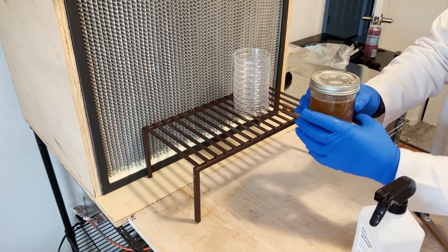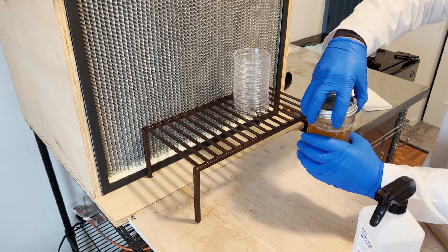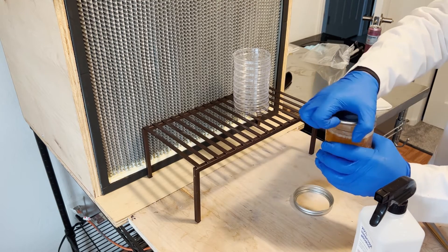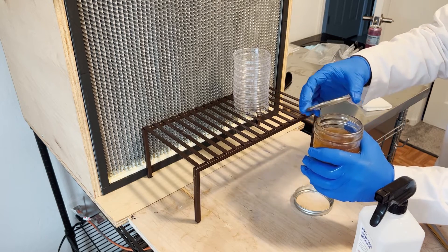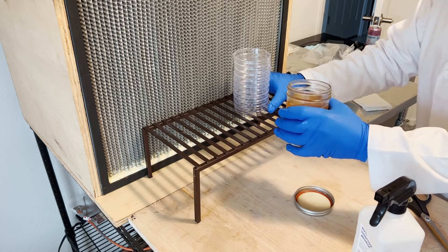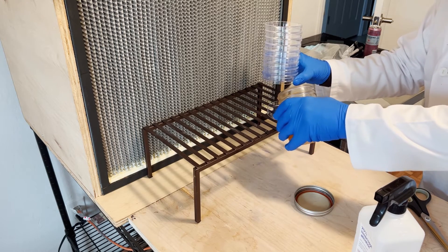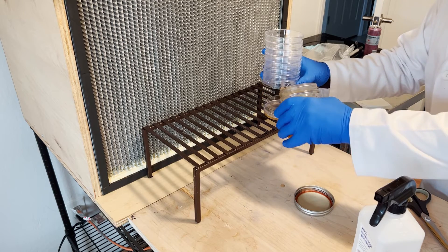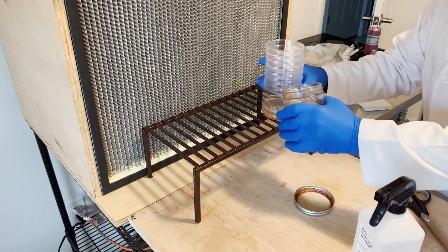Make sure it gets a nice tight seal on there — just use your fingers to pry it up a little bit. You're just looking to not overfill the plate — basically just fill the bottom and then you can stop.